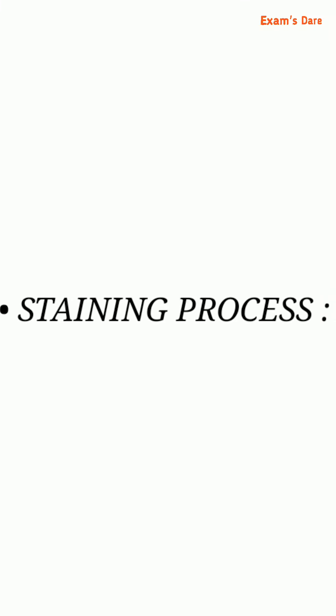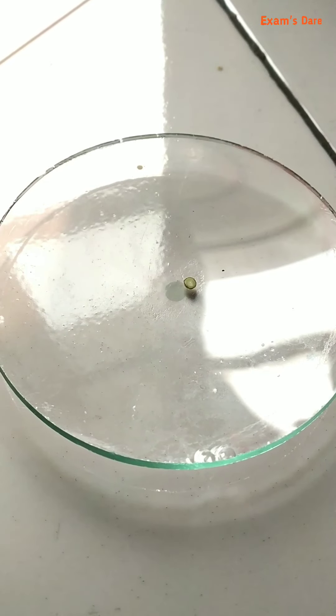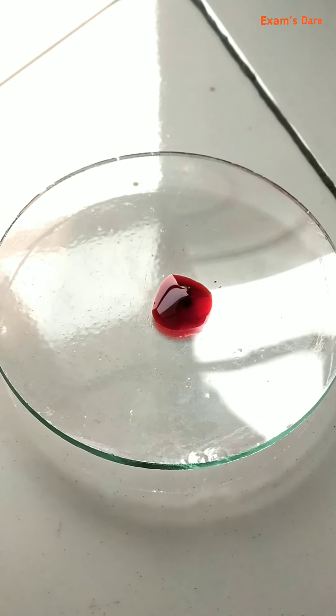Now the section is ready for staining. The next process is staining — safranin dye is used for staining. Take the section in a clean watch glass and add the staining solution to it. Keep for two to three minutes.